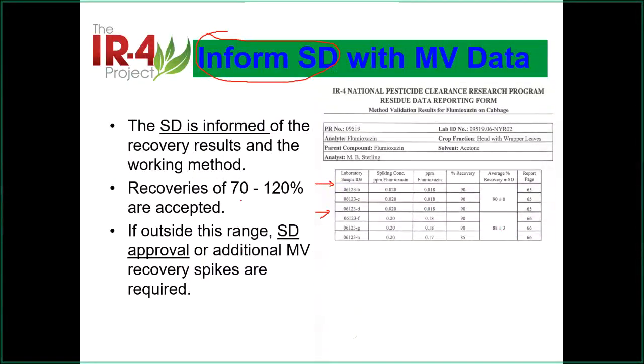And of course, we do know the range should be here. It depends on your application, depends on where you submit the data to EPA. Typically use this one, and I know almost everywhere use this one. But some places use 80, 100, 120, but it depends on that. Then follow whichever is more restrictive. Okay. This is a typical EPA one.